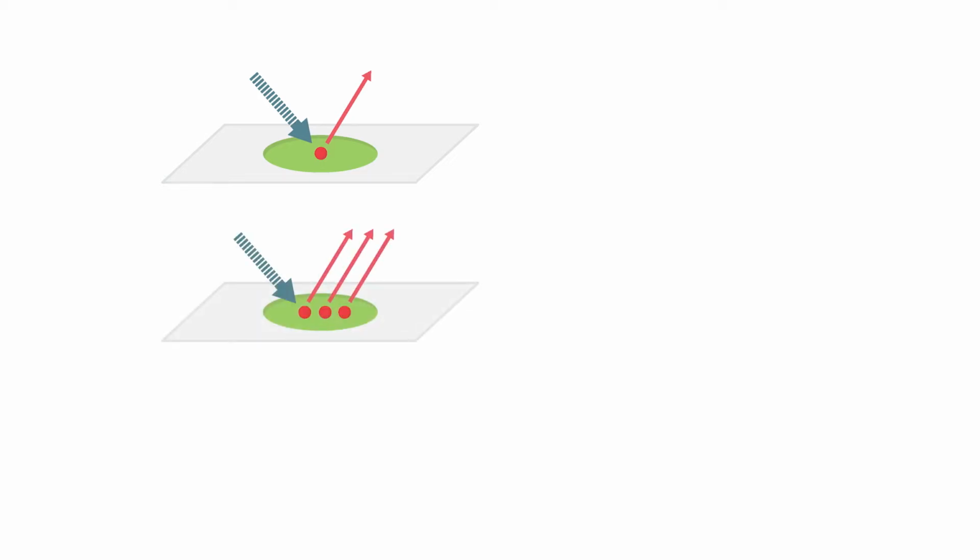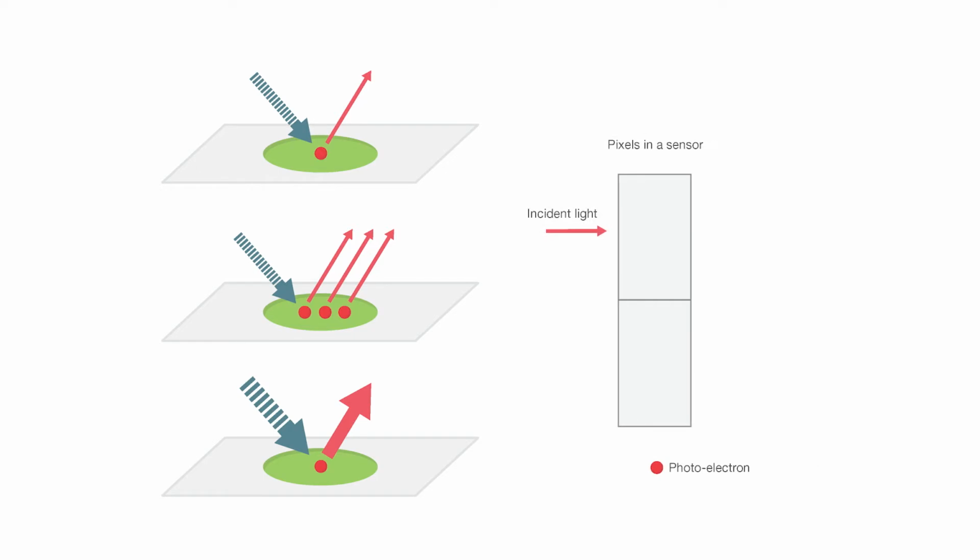The light intensity increases when more targets are in the sample or when we apply stronger excitation light. Then the fluorescence light enters the camera sensor through the microscope optics and stimulates the photoelectrons in the sensor. Stronger light stimulates more photoelectrons. The photoelectrons convert into a digital signal, which is proportional to the incident light intensity.